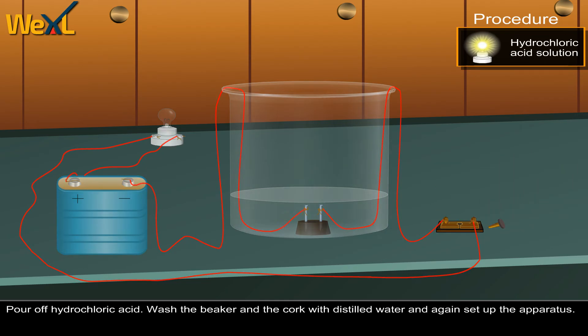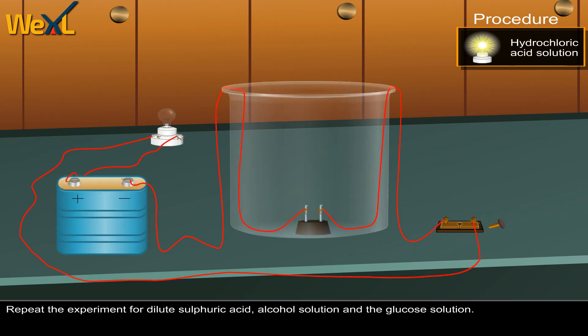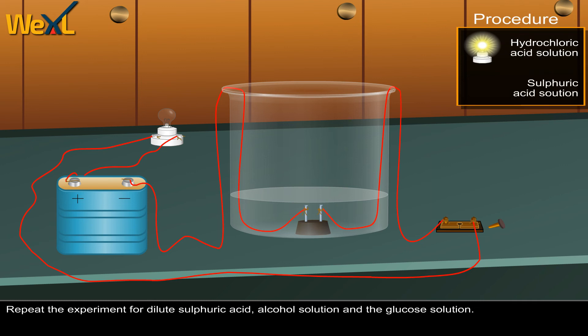Wash the beaker and the cork with distilled water and set up the apparatus again. Repeat the experiment for dilute sulfuric acid, alcohol solution and glucose solution.